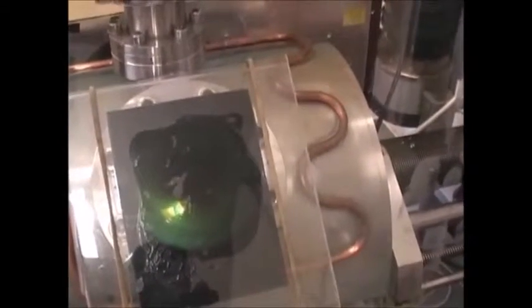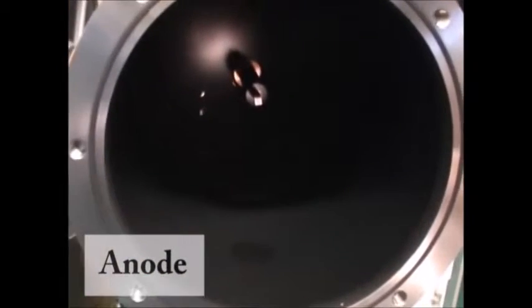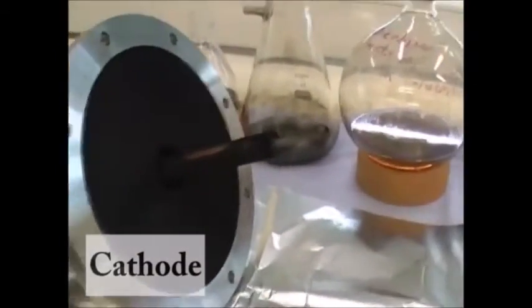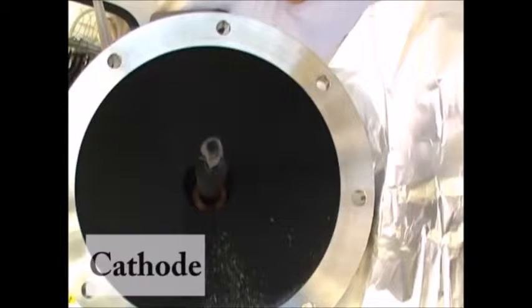Black soot is produced and starts to cover the whole chamber, including the window, so after a while we can't see anything anymore. When we open the chamber, we can see how the anode is being consumed and the black powder is deposited everywhere around. On the cathode there is also black powder, where we will find carbon nanotubes, normally with 20 to 30 walls, although if we also include a metal catalyst in the anode, we can obtain single-walled nanotubes.